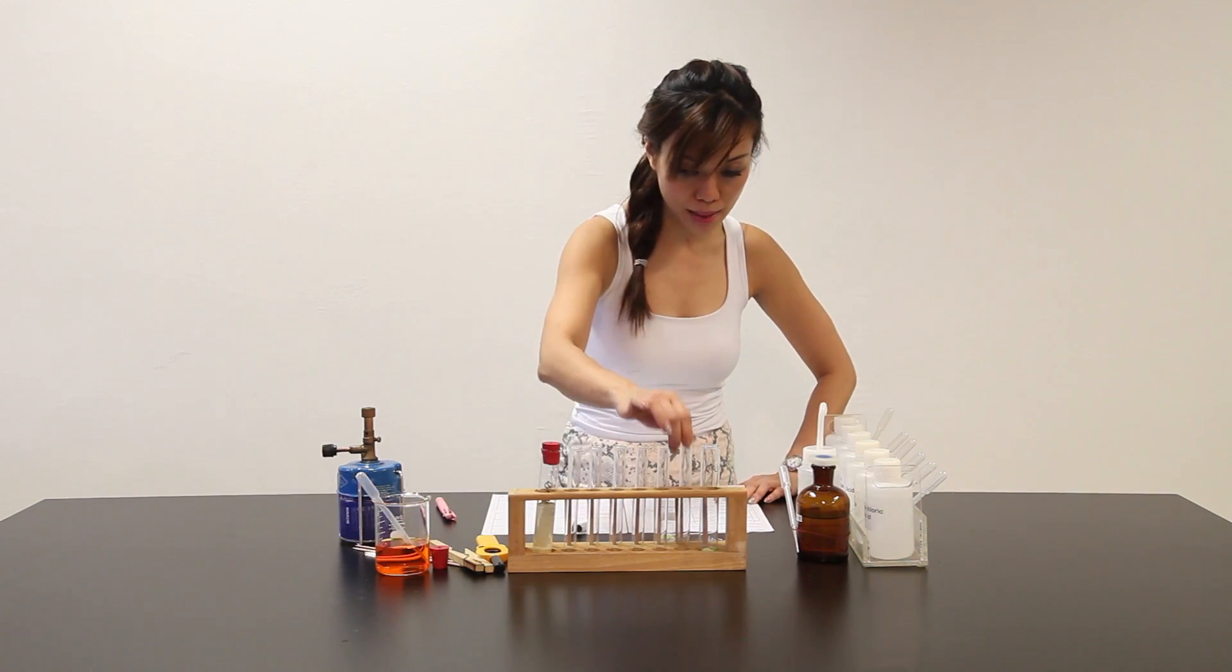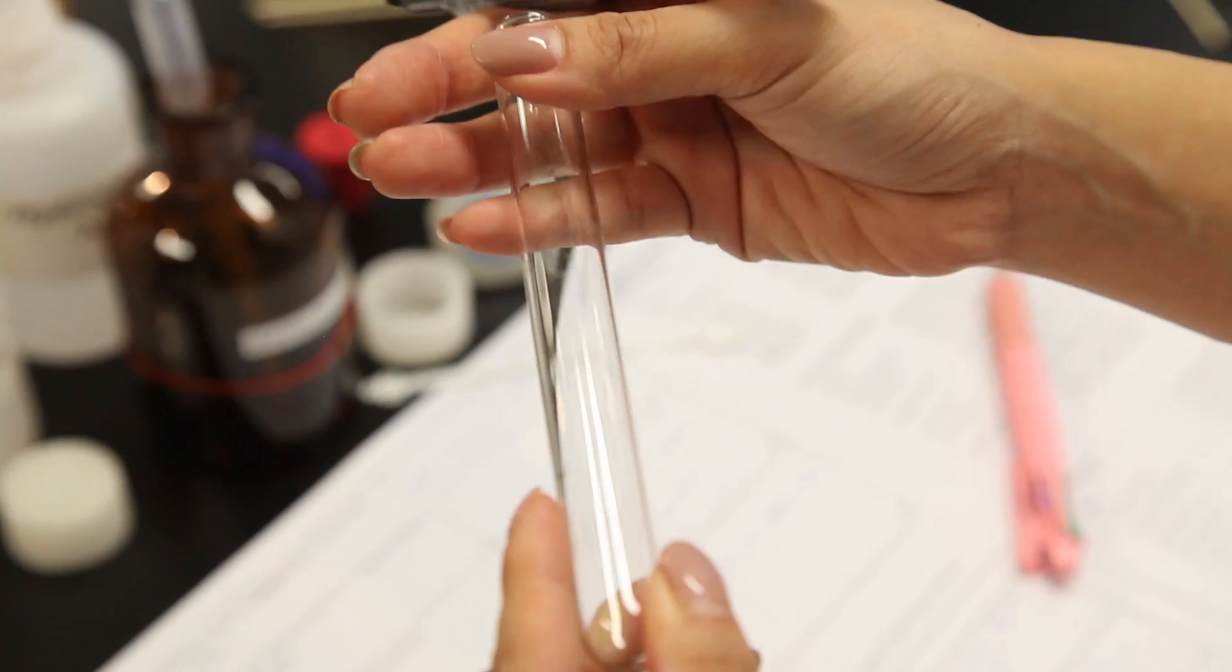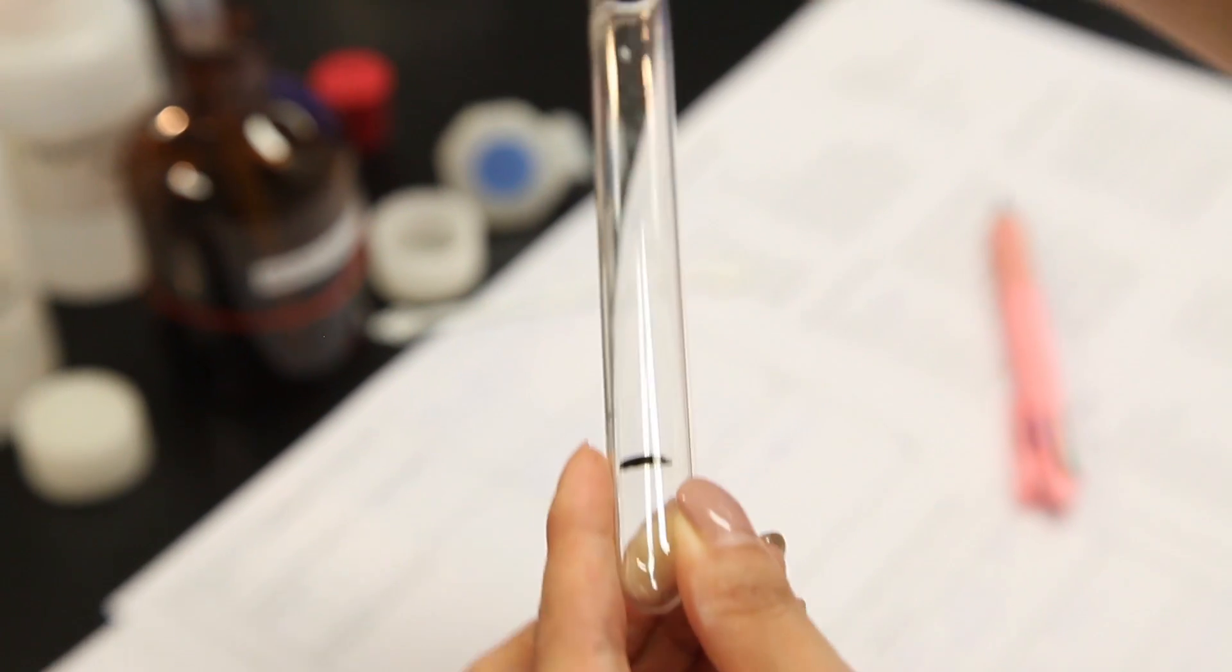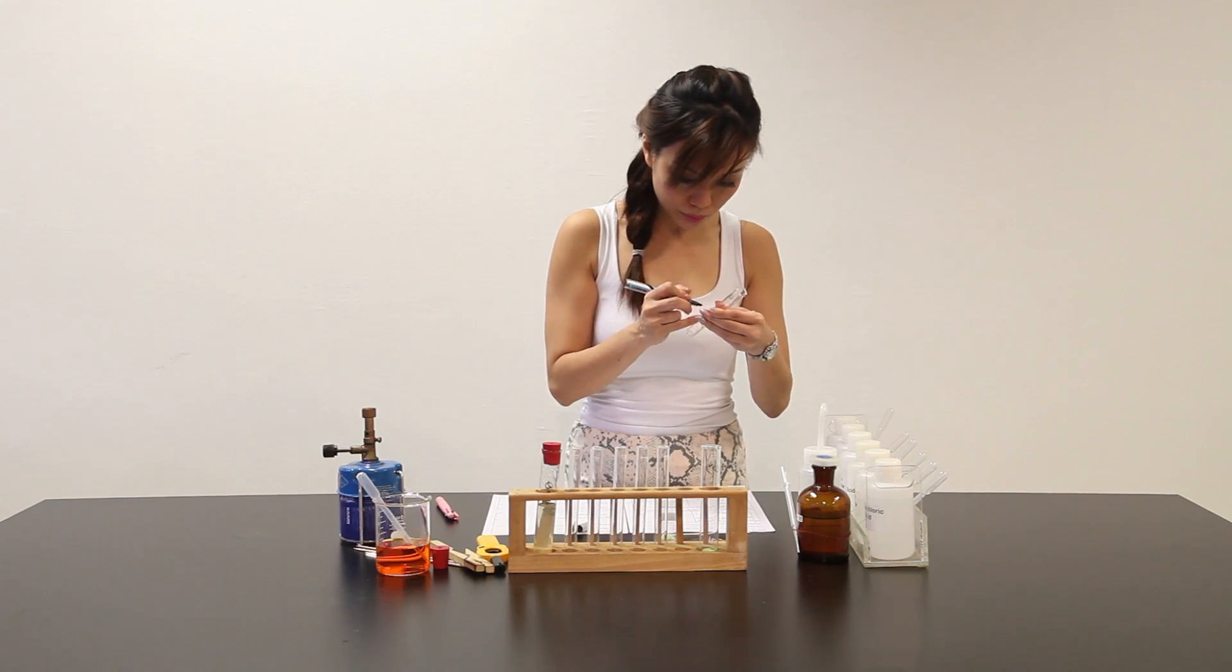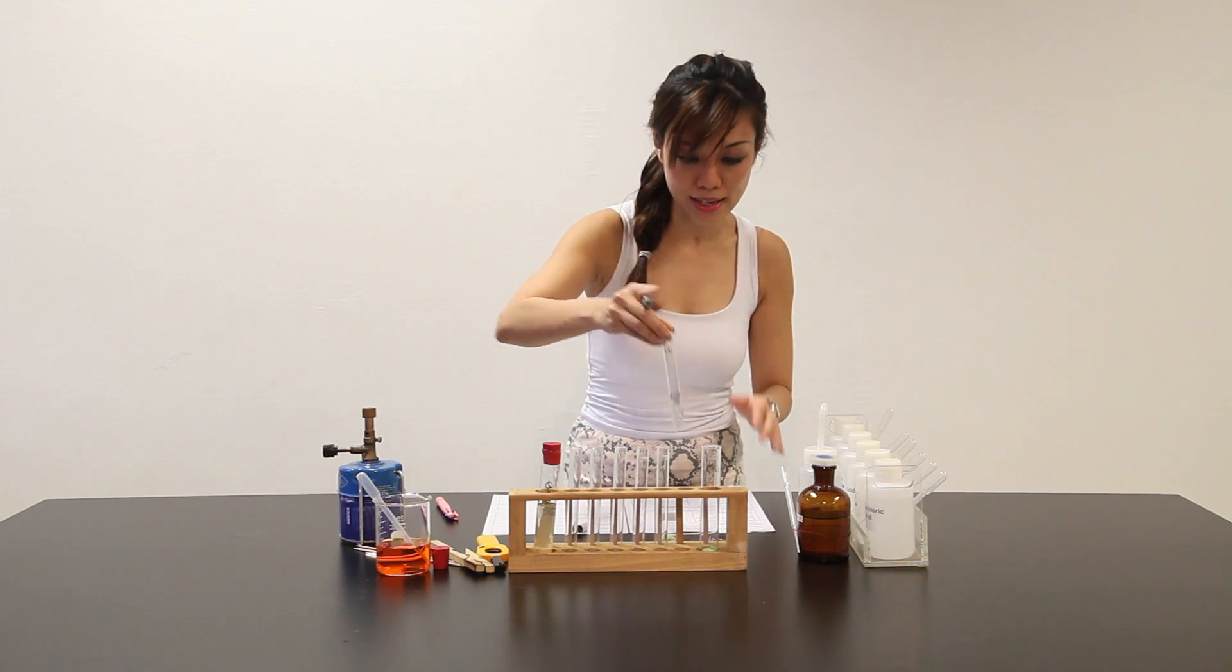So part B says place 3 cm3. Let me use the marker part B. 3 cm3. This is 2. Estimate 3 is about here. 3 cm3 of Q. Solution Q. Into a clean test tube.